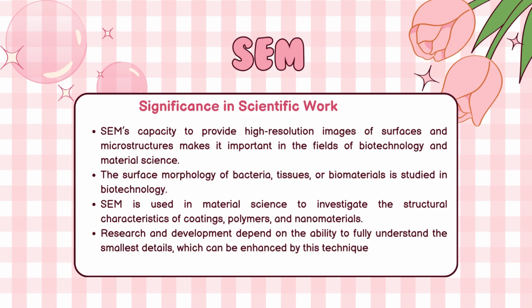Lastly, the significance in scientific work. Scanning electron microscopy's capacity to provide high-resolution images of surfaces and microstructures makes it important in the fields of biotechnology and material science. The surface morphology of bacterial tissues or biomaterials is studied in biotechnology. Scanning electron microscopy is used in material science to investigate the structural characteristics of coatings, polymers and nanomaterials. Lastly, research and development depend on the ability to fully understand the smallest details, which can be enhanced by this technique.